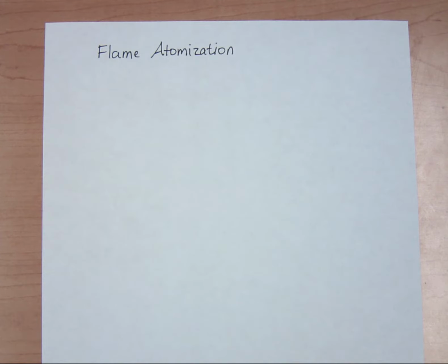One of the common atomization techniques that's used especially with atomic absorption spectroscopy is a flame atomizer. So in this video we're going to look at the flame atomizer and sketch it out and walk through what each part is doing. Now, I am not an artist, I don't pretend to be, but this bare bones sketch of a flame atomizer should get us through the major concepts of flame atomization.